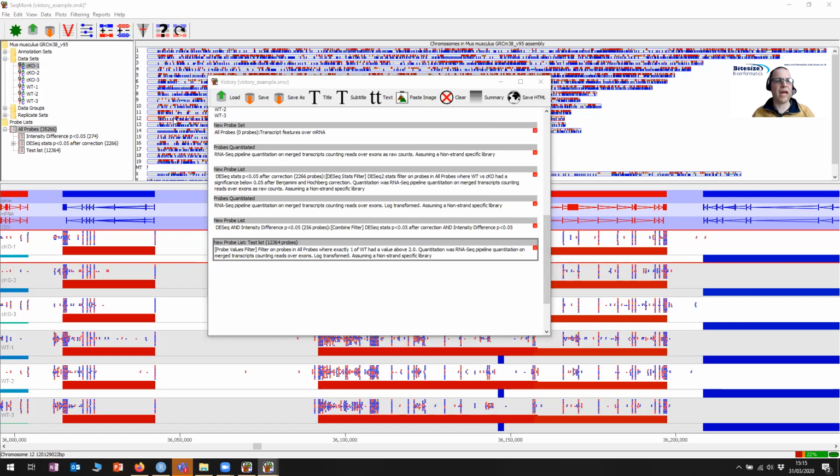So things that will happen is that there may be things that you do and you decide, actually, I went down a blind alley there, or I don't want to go back. And also there's going to be times where you will want to annotate around this. Inside the Vistory, the only things that are recorded are automatic events that change your data. But anything else that you do that you might want to keep, so if you draw interesting figures and graphs or make tables of data, those wouldn't show up.